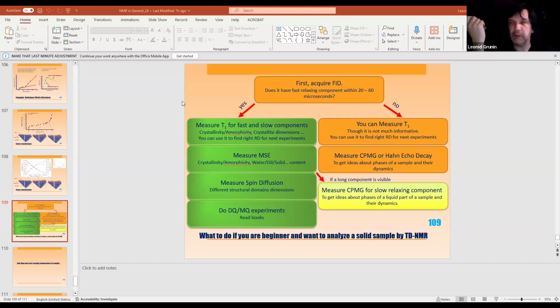And if you are talking about bi-exponential behavior, what ranges of T2 do you get there? So you just mean that the exchange is short compared to spin-lattice relaxation, but not short compared to spin-spin relaxation. Yeah. So in principle, the process is bi-exponential. However, it's averaged out by exchange processes.